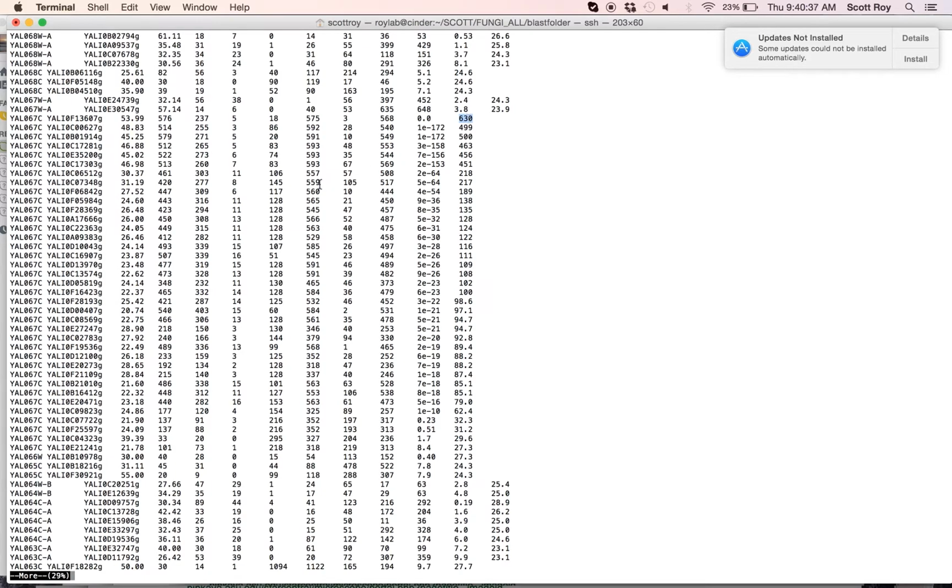Okay, so once you've looked at this for a while, you'll remember where the different things are, though you notice I didn't remember all of them. But you can also sort of work it out by looking at it. However, until you're that comfortable with things, there's actually another thing that we can do. If we do -m9, it's just going to give us the m8, plus it's going to give us a line explaining the columns. So let's do that. We can just put it in another file. And let's look at what we see.